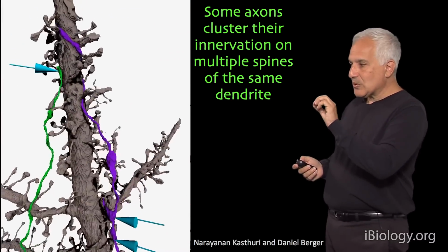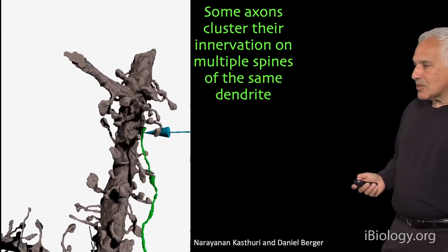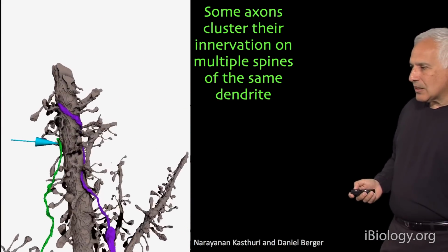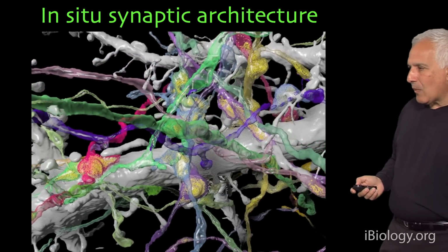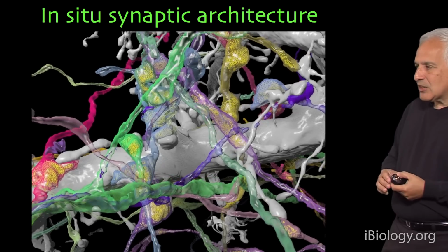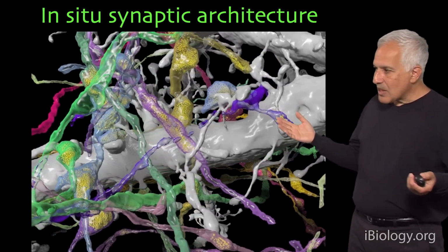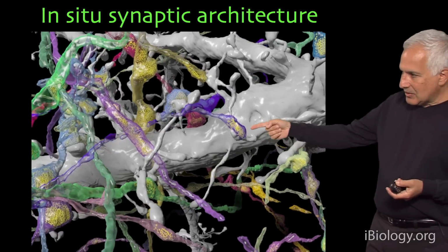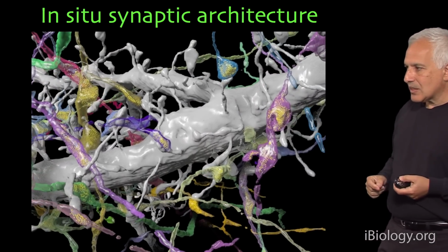And then because, as I said, we can see individual synaptic vesicles, we can go in and look at the synaptic vesicles of every synapse of every axon innervating this cell. And I'll just end by showing you some pictures like that, not so much to make a big point of what we have learned, but how much we don't understand. The brain is vastly complicated. This is not an artist's rendering of the brain. These little yellow dots, each of them is a synaptic vesicle inside a synapse.